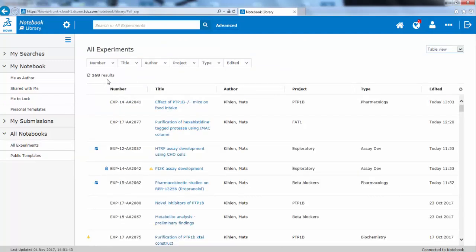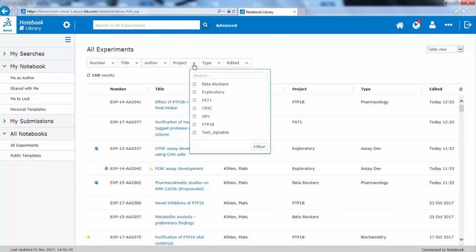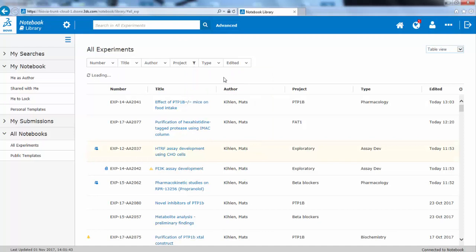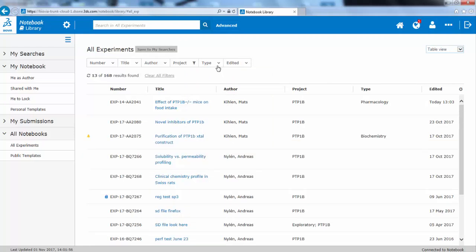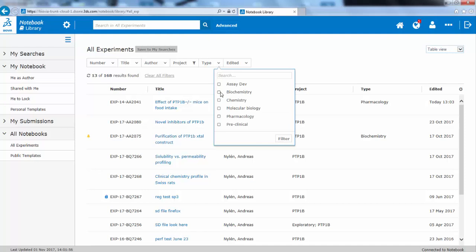Initially, you can list all the experiments in the system. Then there are a number of filters that you can apply. If you want to see a particular project, you can find that, or you can specify you are only interested in some particular experiment types, like biochemistry.